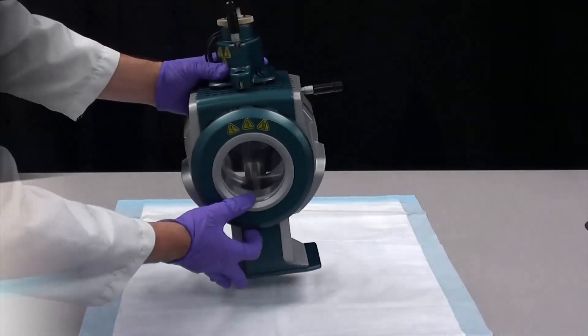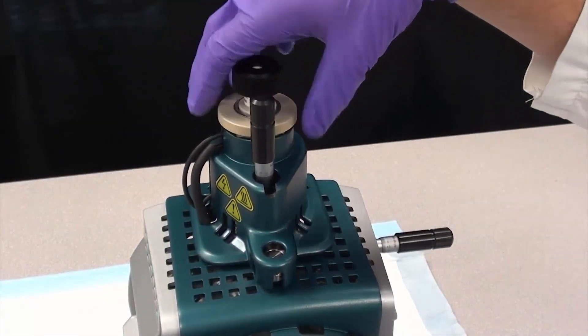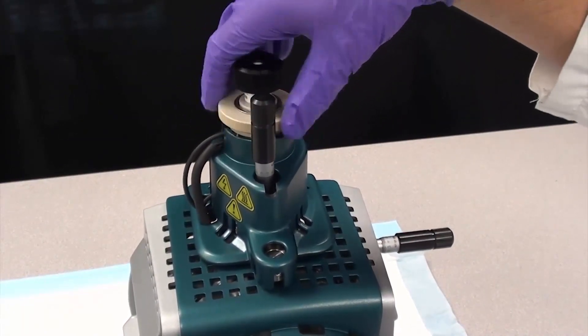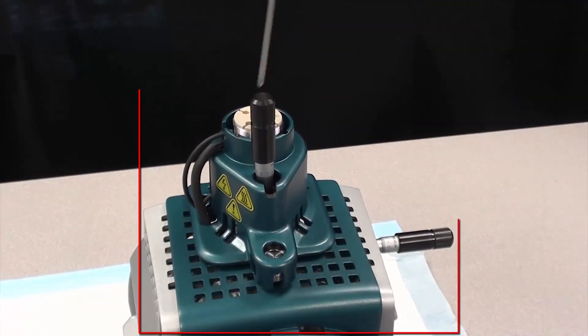Disconnect the sample tubing from the probe. Loosen the retaining ring that secures the probe on the ion source housing. Gently pull the probe straight up out of the tower. Do not let the protruding electrode tip or the corona discharge needle touch any part of the ion source housing.